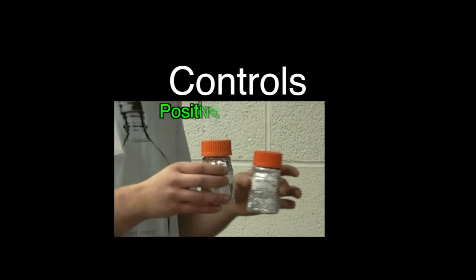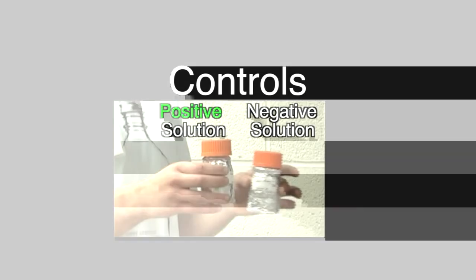So there's a negative control and a positive. So say you got a black ring in both your negative and positive solution for one of these trees, that would mean that there's some sort of contamination, maybe some plus solution got into the minus. In that case, it would be a null and void experiment and it would prove nothing.